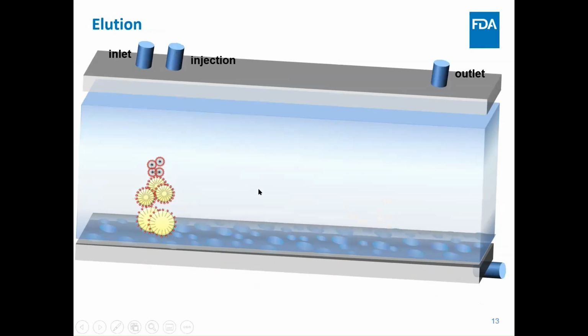So the next step is the elution. The liquid flow in this step is different from the previous injection and relaxation. To be noticed, the actual channel thickness is only 350 microns, and the sample in general stays about 10 micrometers away from the membrane. Here, all these are not to scale, kind of exaggerated to show you what actually happens during the separation.